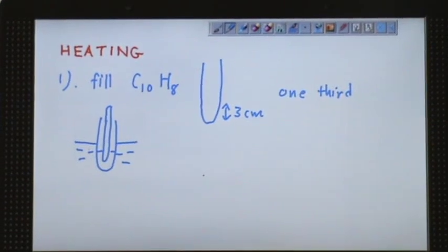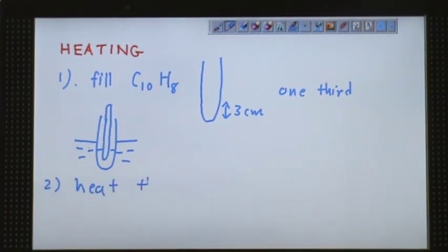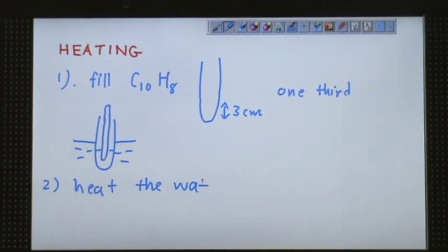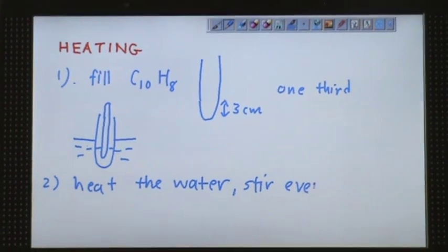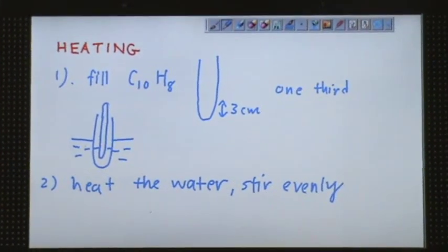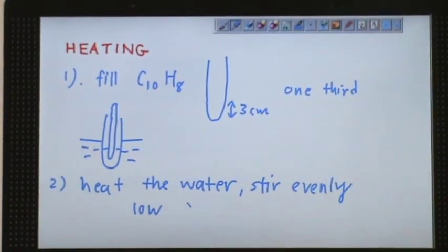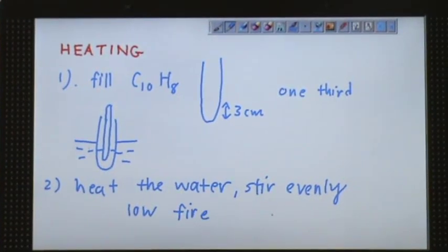The next thing is you want to heat up the water. Second step, you heat the water and stir evenly. When you heat up the water with fire, make sure you use low fire.